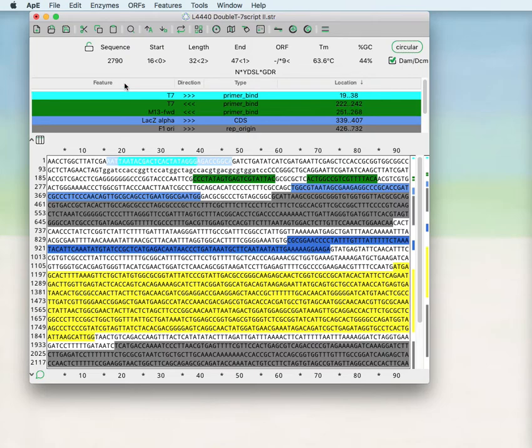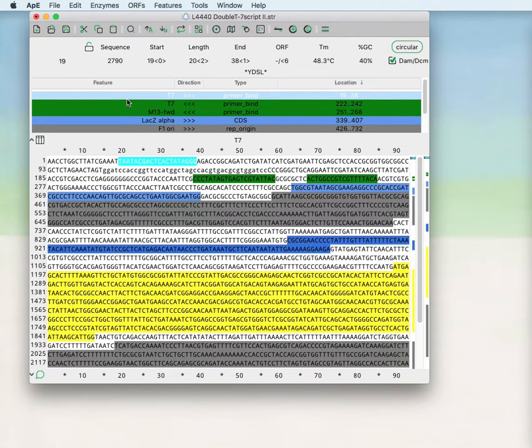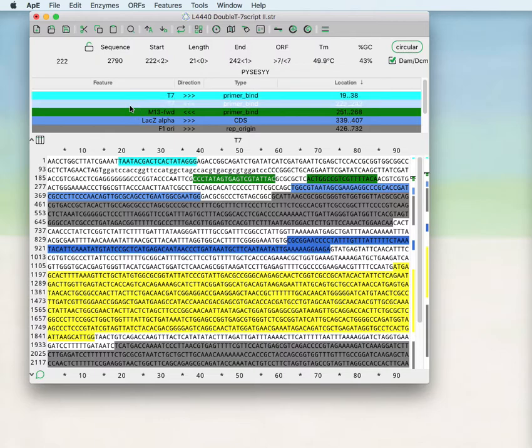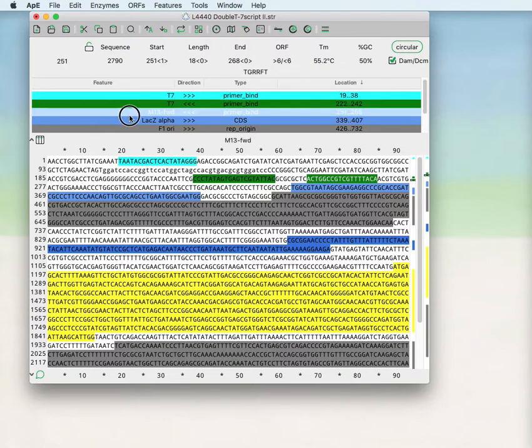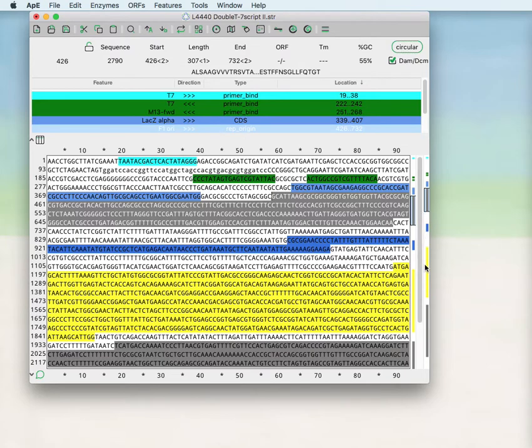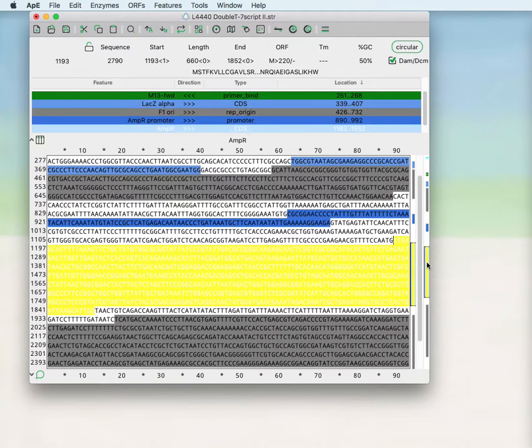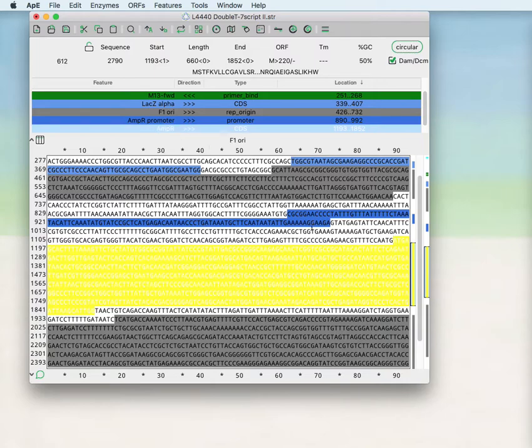The feature table can be clicked to go to particular features or you can go to features by clicking on them within the map. So you can click to any of these and that will highlight both the feature in the feature table and in this sequence.